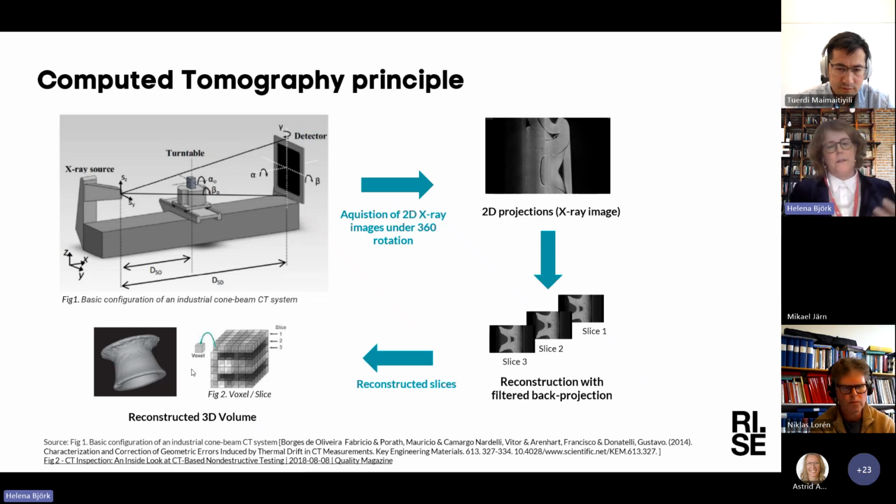In pictures you work with pixels, but here you work with voxels, so that will be your reconstructed 3D volume. You also work with the distance between the source, the detector and the object. There are a couple of techniques with the X-ray source, but I won't go into that because we will have another seminar on it, I think. I'm not the expert, so I leave that to others. There is a lot of technology involved in this, but that is a simple description of tomography.